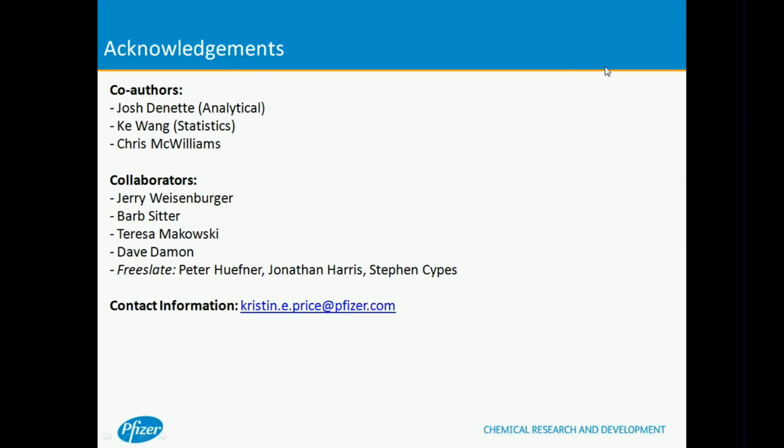We're willing to take that hit because by using the feedback loop, we've eliminated a lot of duplicate reactions or very similar reactions. So we just run a few more after the feedback loop.